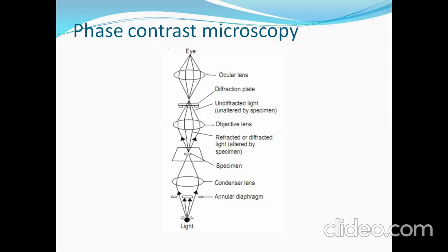So that we can view a particular point at a particular time. There is no interference from the surrounding light waves, so the image is crystal clear. In the confocal microscope also we are using certain dyes, and the excitation filter, dichroic mirror, and emission filters are all there.